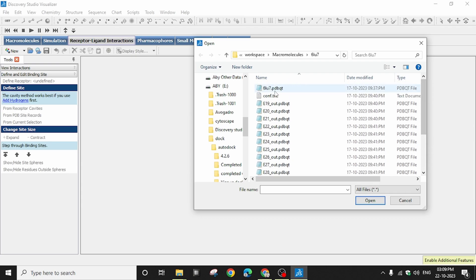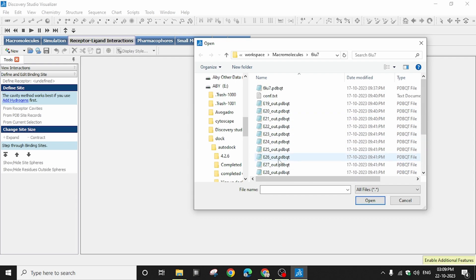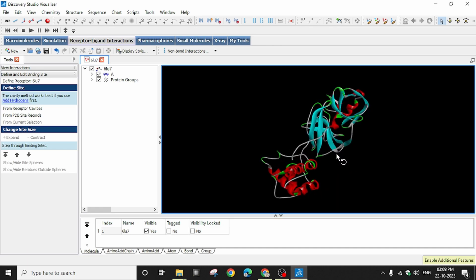These are the files in my parent folder. The 6LU7.pdbqt is my protein that I have selected. I prepared the protein by adding charges, repairing missing residues, and adding hydrogens. These are the various drugs I used — E19 to E36, many ligands. If you have any doubt regarding multi-ligand docking, refer to my other uploaded videos. Now for the docking result analysis, I will first open the protein output file.